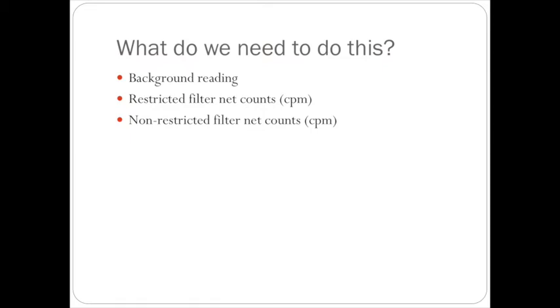Once you have those values, you just take the microcuries of iodine that you calculated on your filter, again corrected for efficiency, and divide it by the total number of milliliters that actually went through your system, and you now have your bioassay level. Or your air monitoring level, sorry. And so basically we compare that level to the limits and we see if we're within specs.